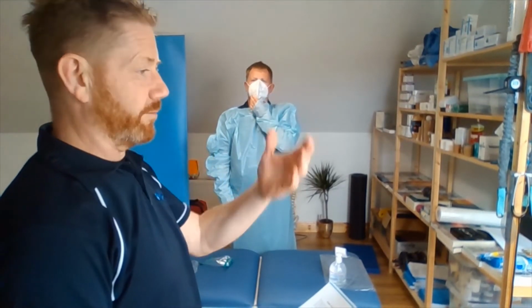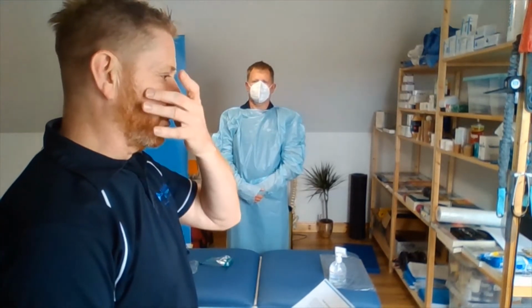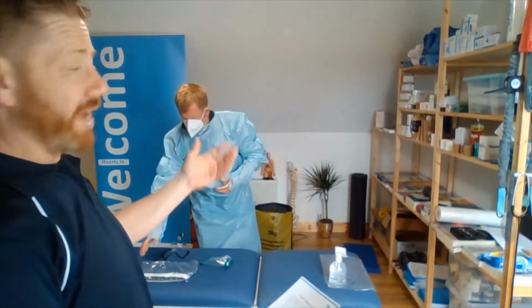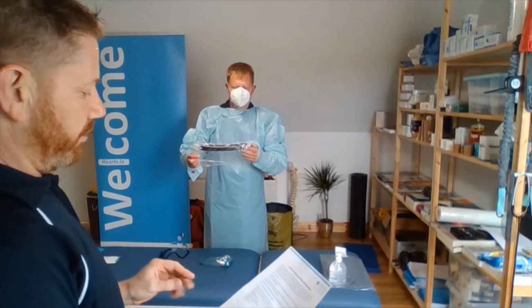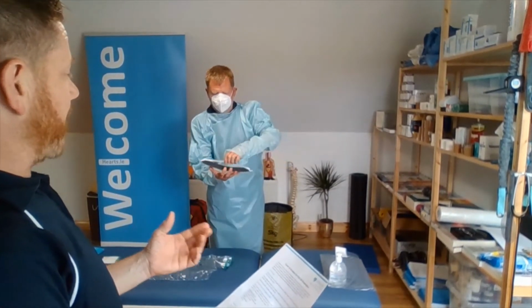For myself and Sean, if you have a beard or whatever, you want to make as good a seal as is possible. Usually a breath in and out confirms it, if you can see the mask moving in and out. The next piece of equipment is some eye protection, or a full face mask in this case.